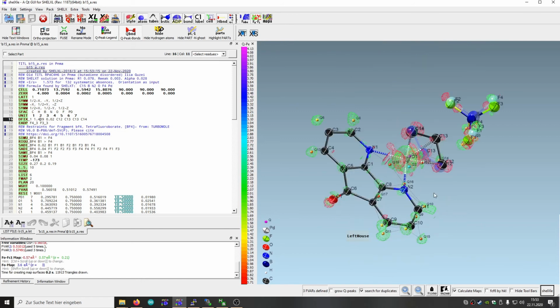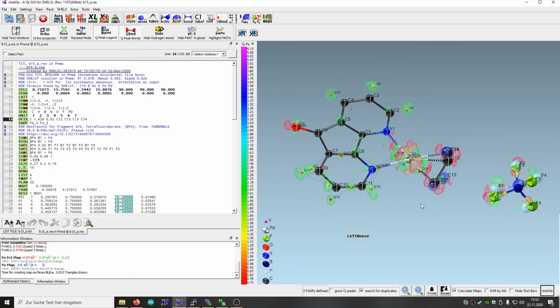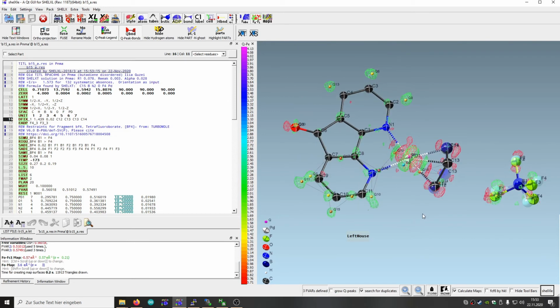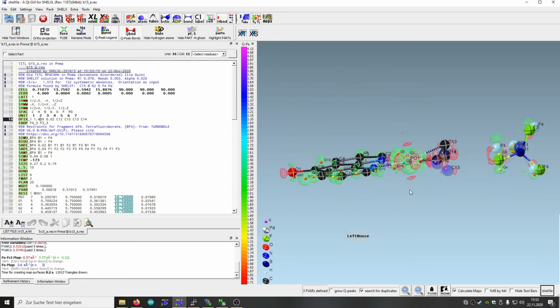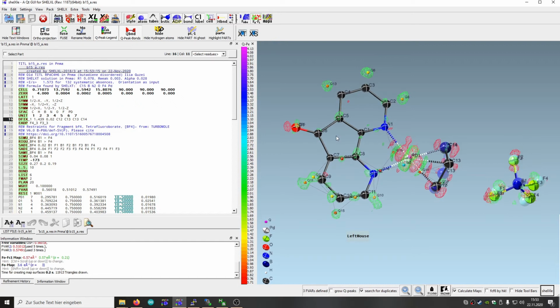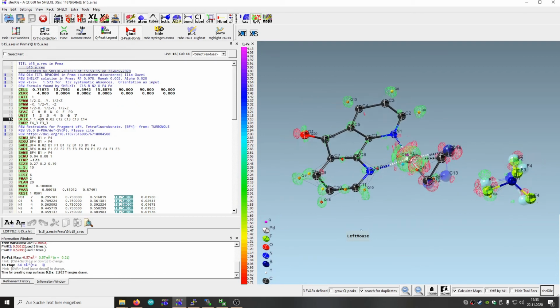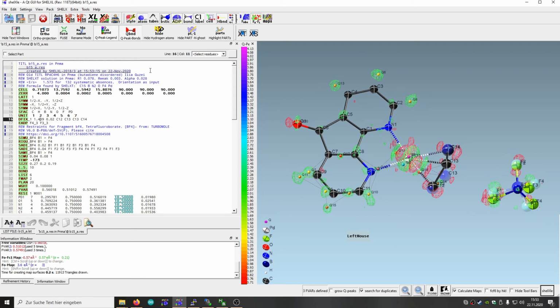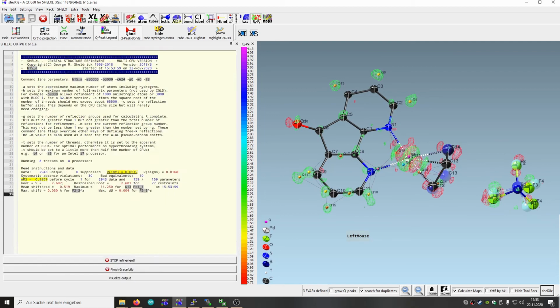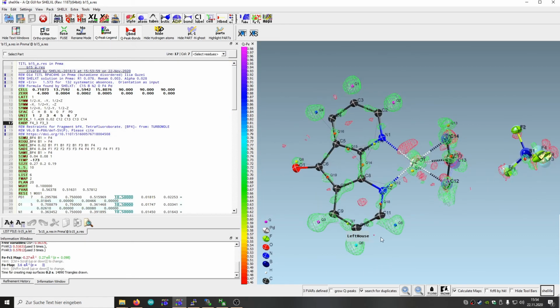Sorry for having problems. So one thing you have to learn, if you do disorder, there is not a straight way of doing it. It's always experimenting around and figuring out the right way of it. So one thing you could see, we are still isotropic with our isotropic thermal parameters for each atom, and this is very quickly done. Just click here on refine anisotropically.